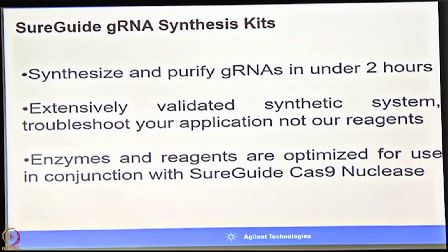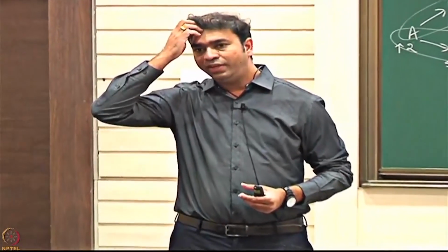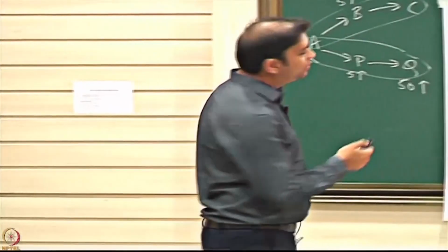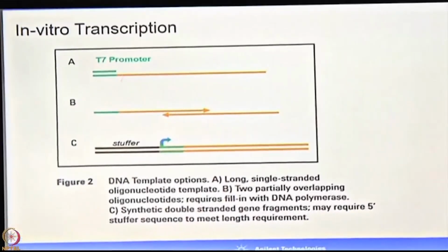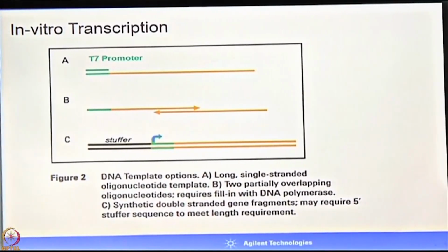So now the question is, suppose you work on cystic fibrosis, right? You work on a single gene, and there may be 1 or 2 mutations you got with the exome panel, right? And you want to fix that problem, right? So there are 2 ways. One way: if it is one gene and a few mutations, you're going to use 4 to 5 different guide RNAs, not more than that, right? For that, you can make the guide RNAs in your lab. So suppose this is the target. You're going to make a guide RNA for that one only. So this is the target you want.